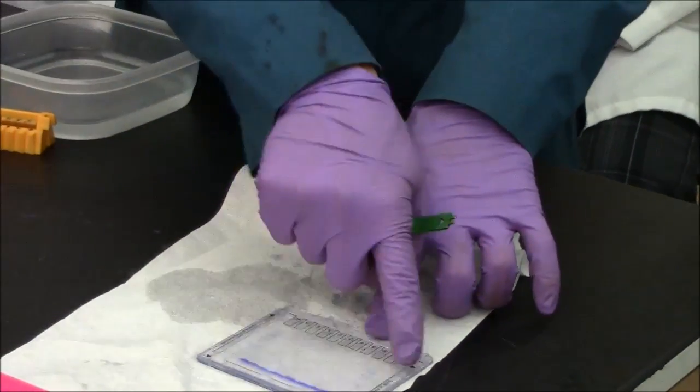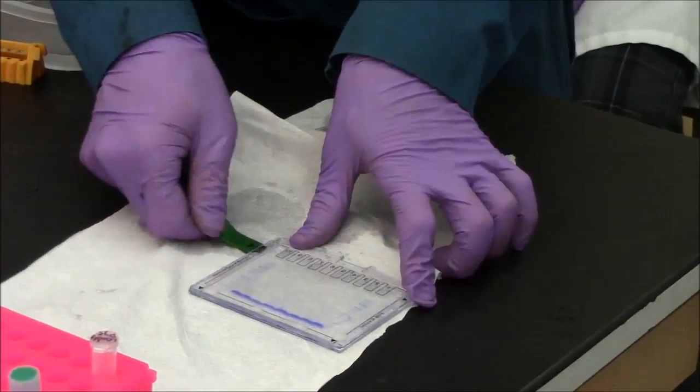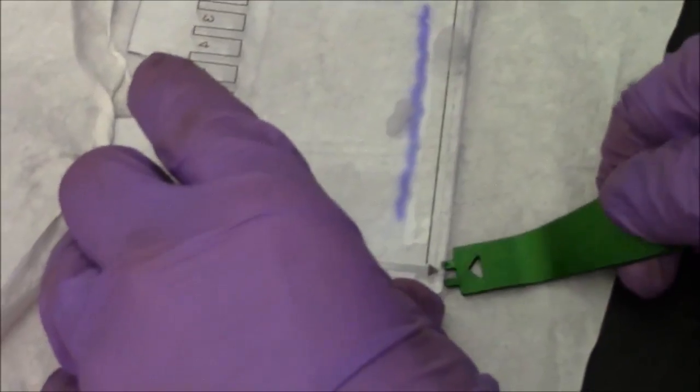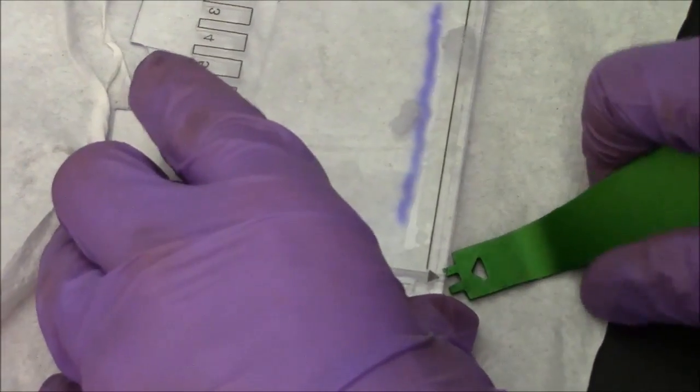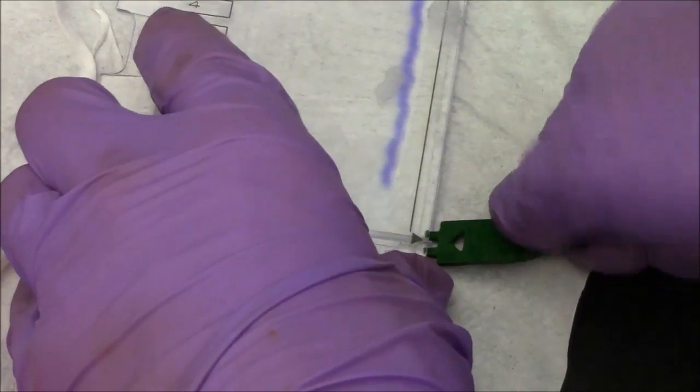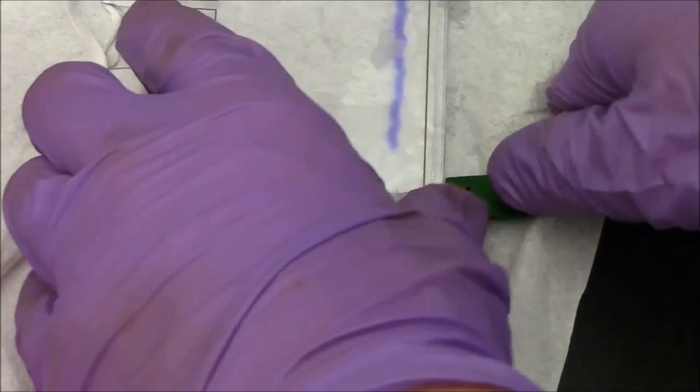The Biorad gel is in a cassette with four black triangles, and a special tool comes with the Biorad gel. You want to jam the tool in where the triangle is, and then give a brief twist, and you'll hear a snap as the plates are detaching from each other.